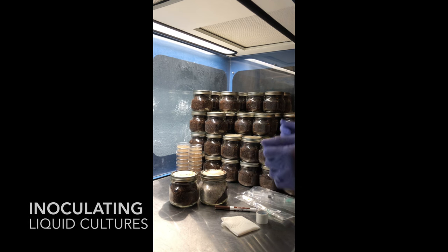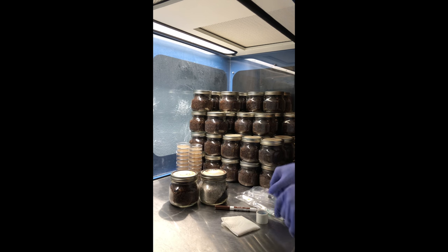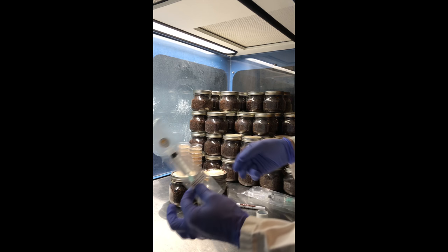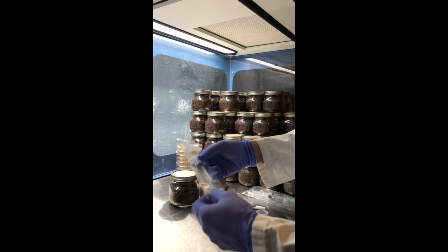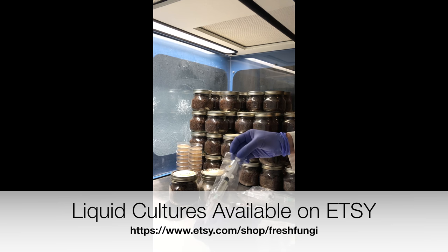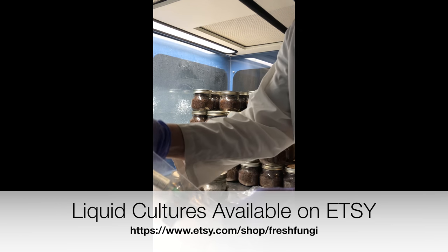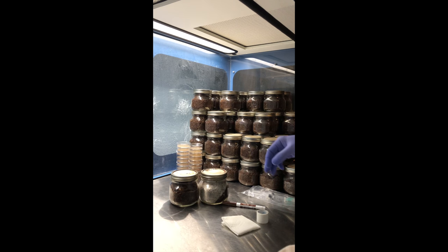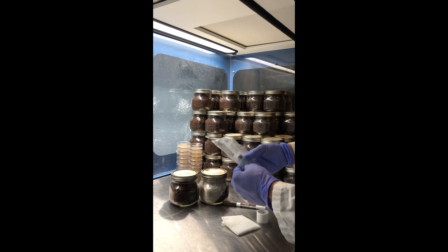Hey guys, I'm going to show you how I inoculate my jars with one of our spore syringes that are now available on Etsy. Check out our Etsy site — we have four different varieties right now. This one is our local Elm oyster, but I'm actually going to be inoculating some jars with shiitake.